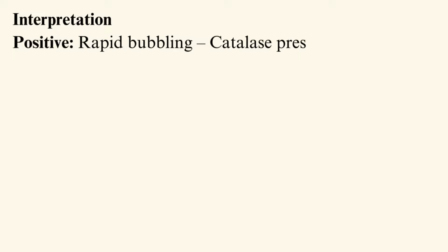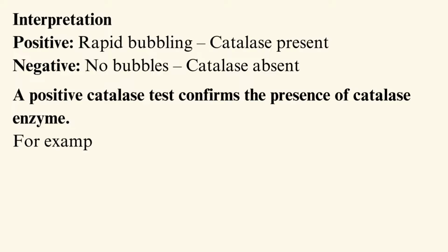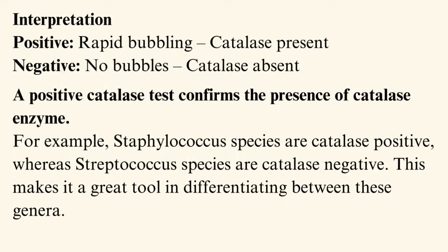Interpretation: positive, rapid bubbling, catalase present; negative, no bubbles, catalase absent. A positive catalase test confirms the presence of catalase enzyme. For example, Staphylococcus species are catalase positive, whereas Streptococcus species are catalase negative. This makes it a great tool in differentiating between these genera.